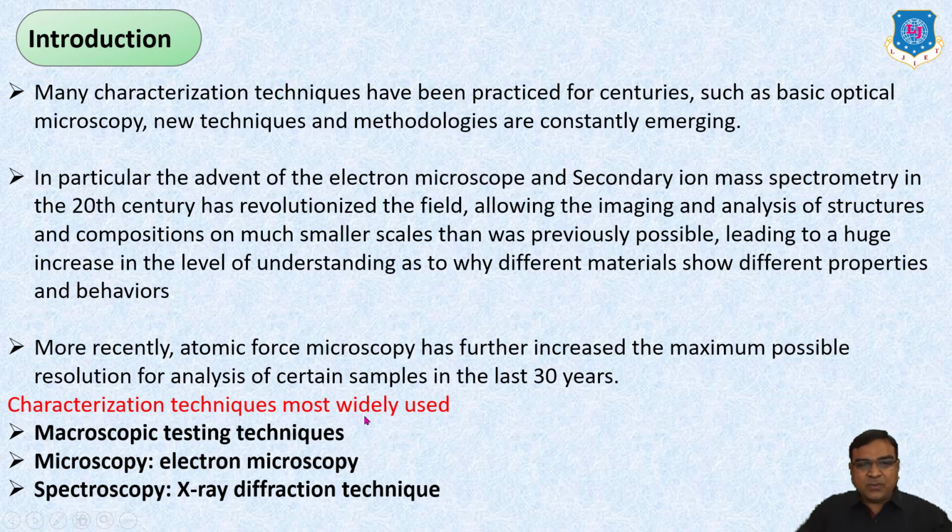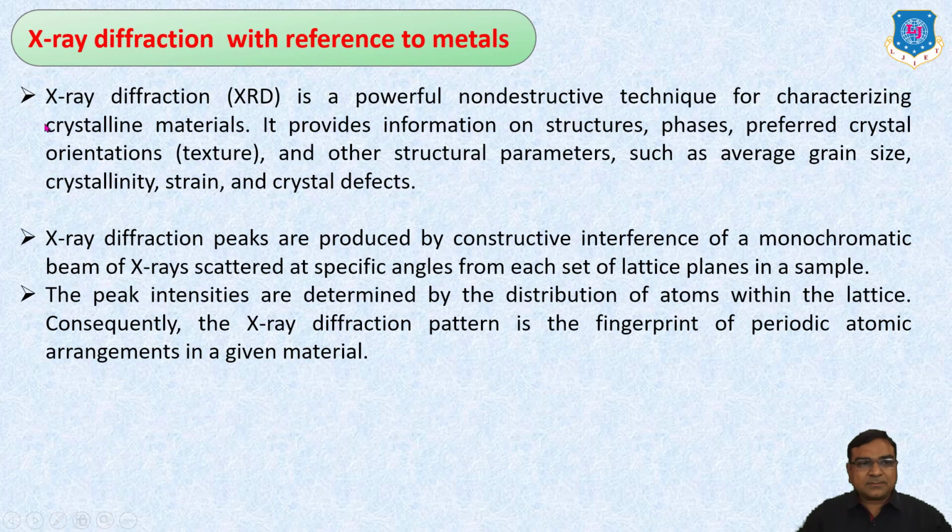Characterization techniques are most widely used in three types: macroscopic testing techniques, microscopy and electron microscopy, and spectroscopy, that is, the X-ray diffraction technique. X-ray diffraction with reference to metals.